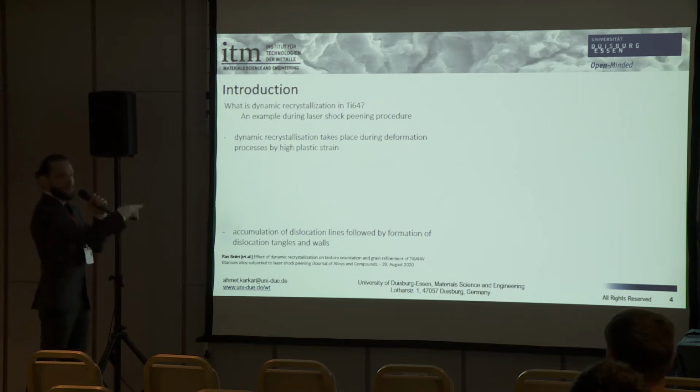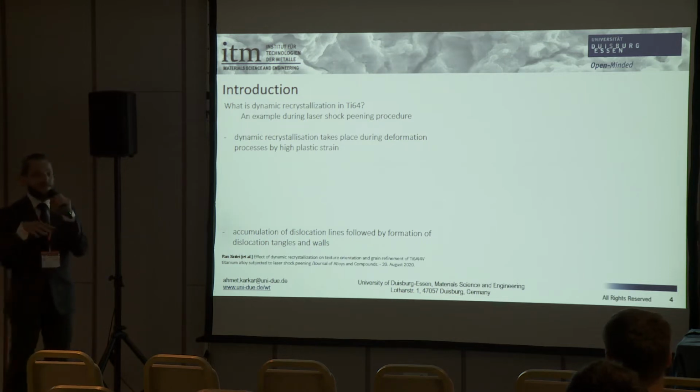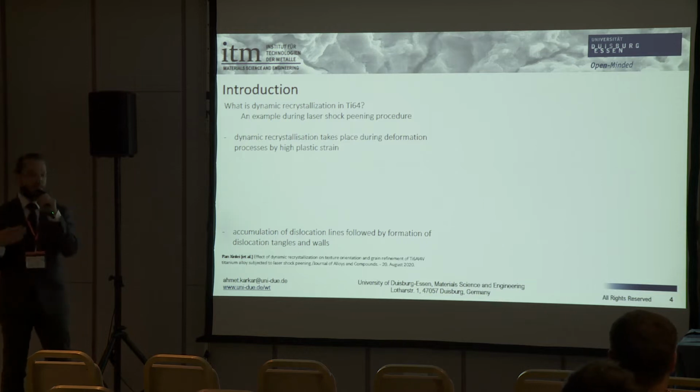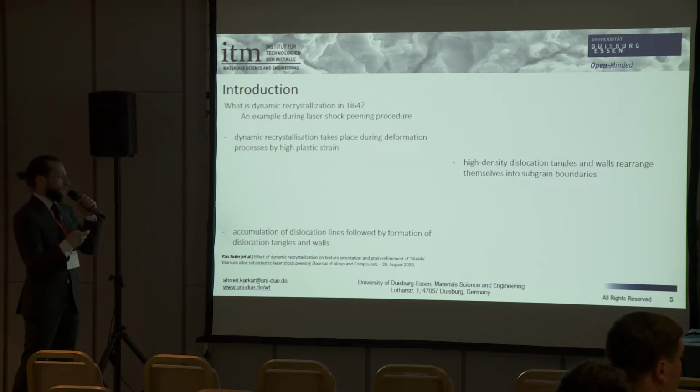Okay, here should be a picture of TEM investigations where we can see in titanium 6-4 after laser shock peening how the microstructure is developing, but actually, we can't see any pictures.